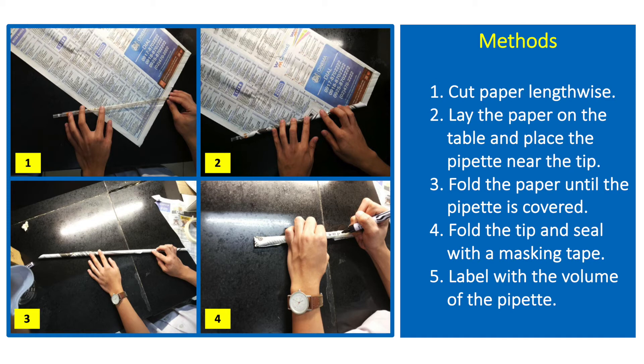Cut a piece of paper lengthwise, lay the paper on the table, and place the pipette near the tip. Fold the paper until the whole length of the pipette is covered. Fold the tip of the paper, seal with masking tape, then label the pipette with its volume or capacity.